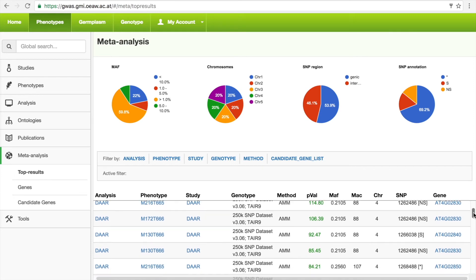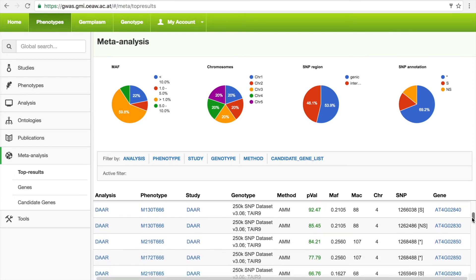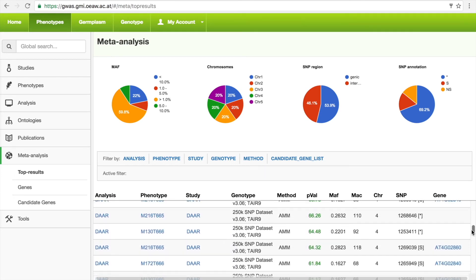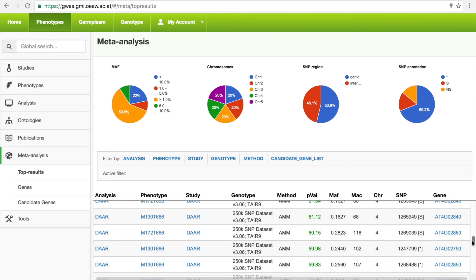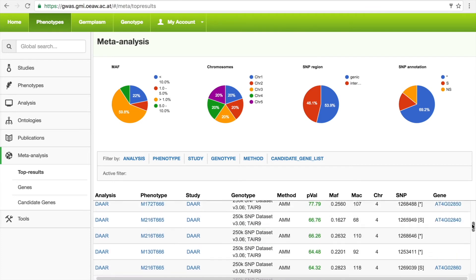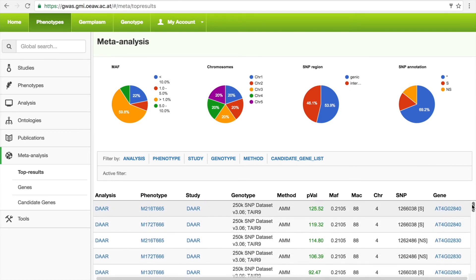One of the first use cases is to come to the site and look for the top results under the meta-analysis section. This displays a table of all of the associations for all of the available GWAS studies, ranked by the score of their p-value. There are currently 3 million publicly available associations.